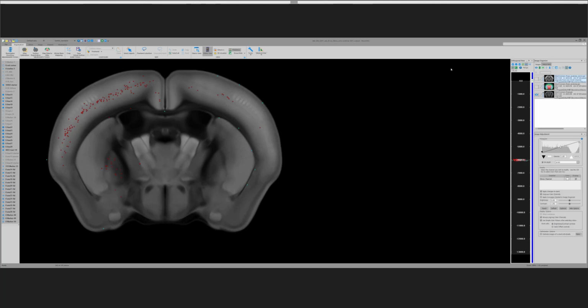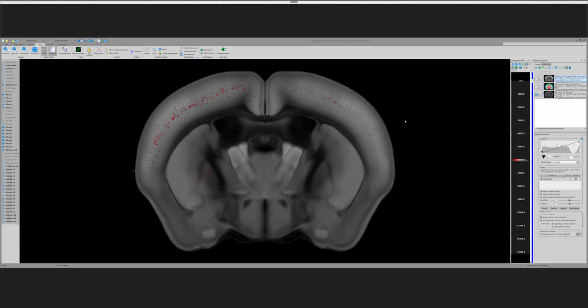As I said, with the Excel spreadsheets, the data presented has the cells in each structure, and that allows us to do things like, in this case, compare the number of neurons in primary motor cortex or secondary motor cortex between the different experimental conditions: the normal, Parkinson's model, Parkinson's with L-DOPA treatment, things like that. And I think I am about done.